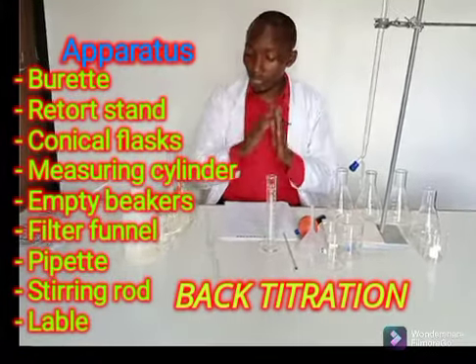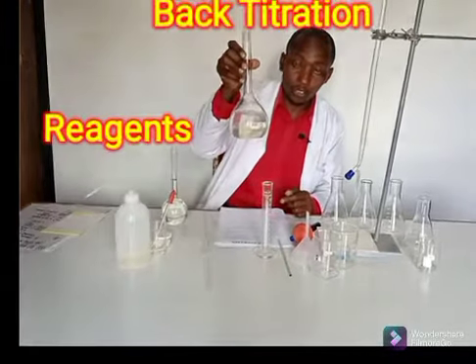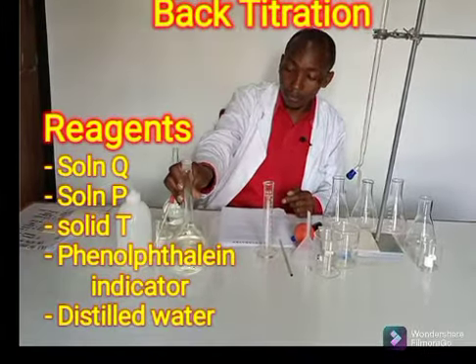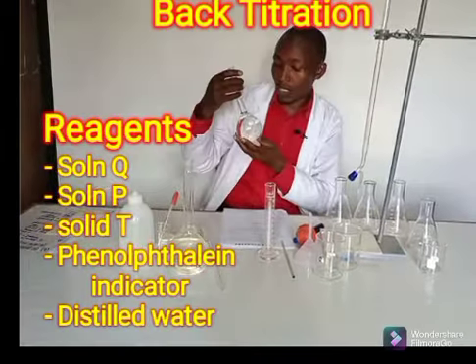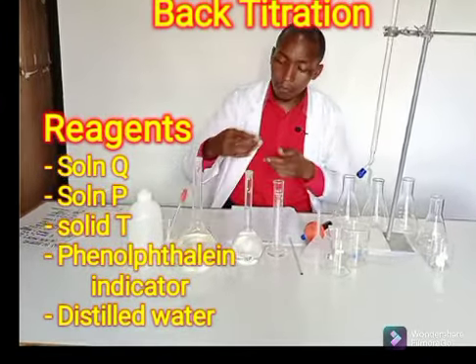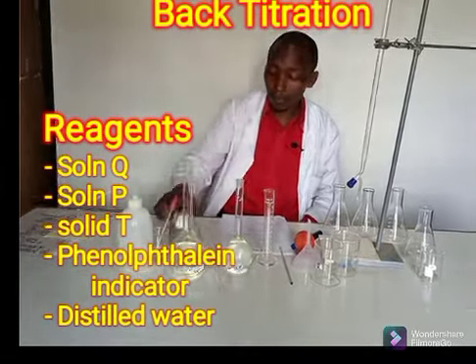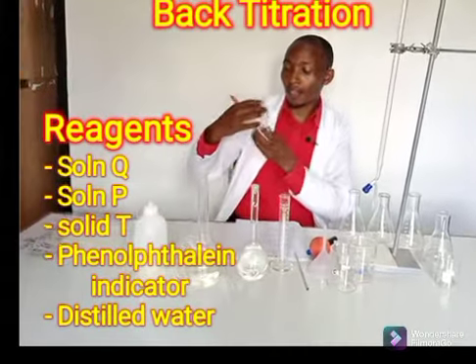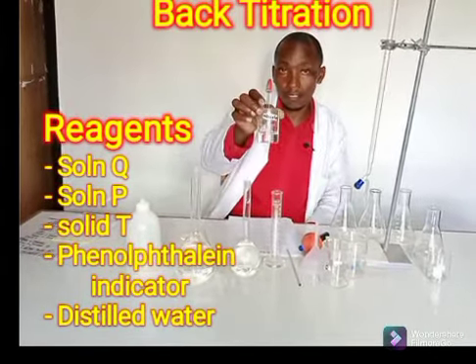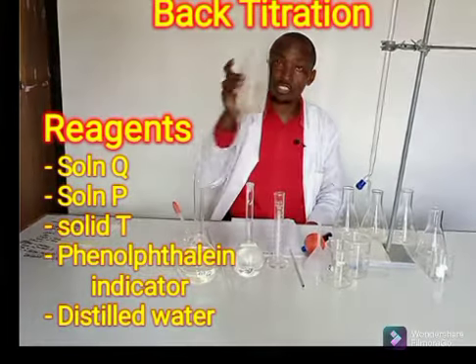For my procedure, I will work with the solution here, labeled solution Q. I have another solution here labeled solution P. I will work with a solid labeled T, solid T. In here, I have phenolphthalein indicator. And I will have some distilled water.